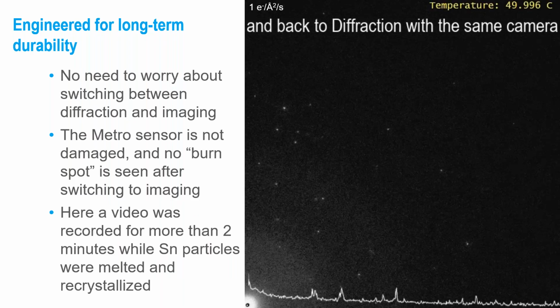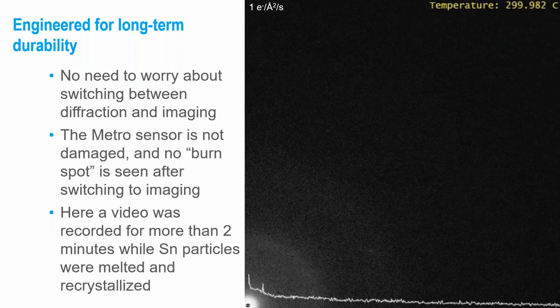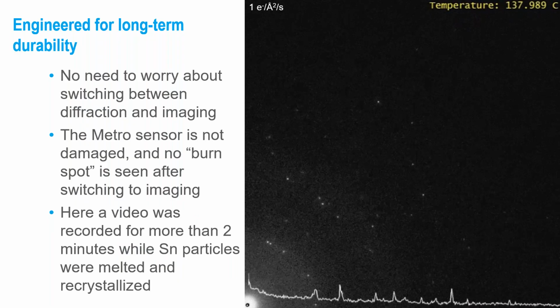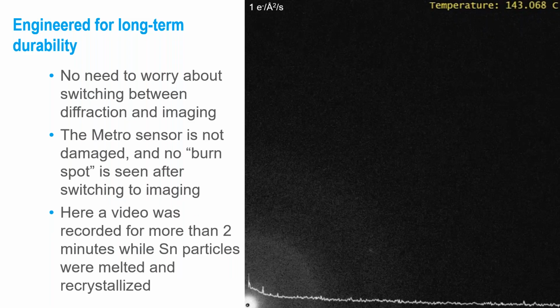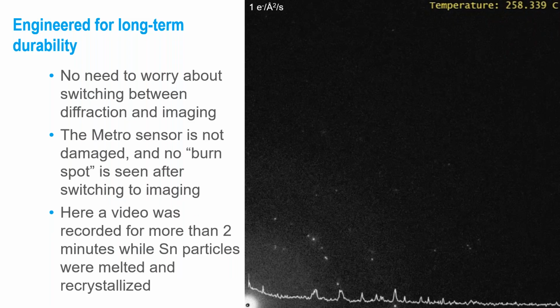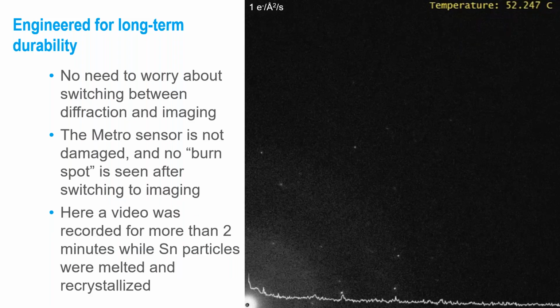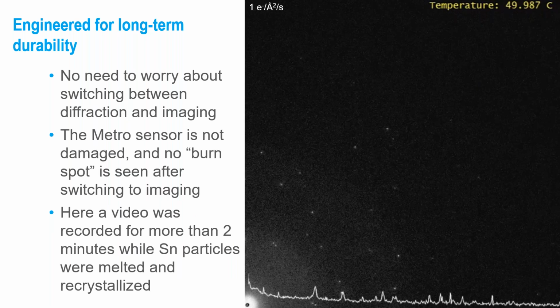And in fact, this is only the first part of a much longer video where for 2 minutes, I recorded diffraction while some tin nanoparticles melted and recrystallized. And I was able to do an entire real in situ experiment on this sample without worrying that I was damaging the camera.